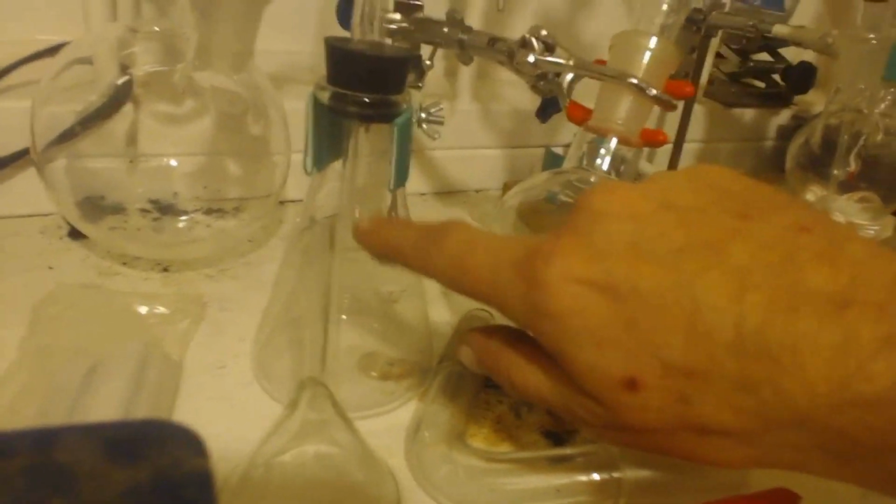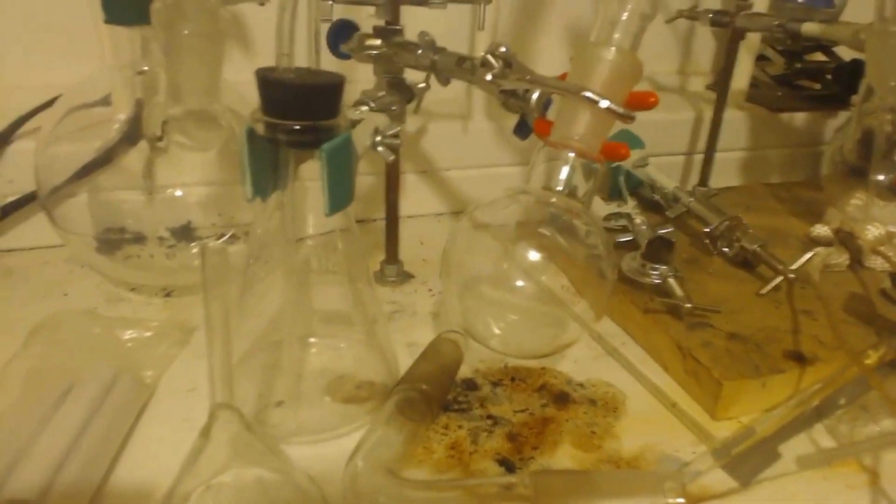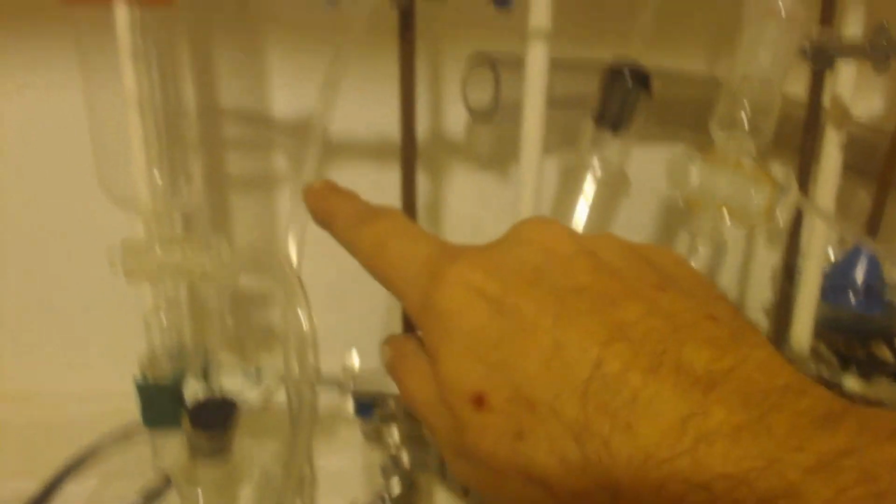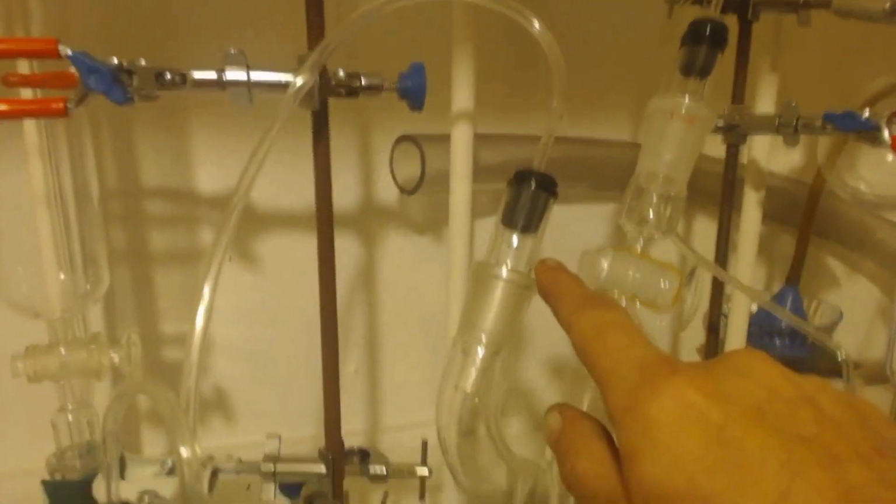See that tube inside? It goes all the way to the bottom. Chlorine has to go up through the calcium chloride. I'm not going to pack it or anything. I'm just going to put chunks of it lightly up to about here. Now it has to come out this hose, right? Goes up this hose all the way down here.